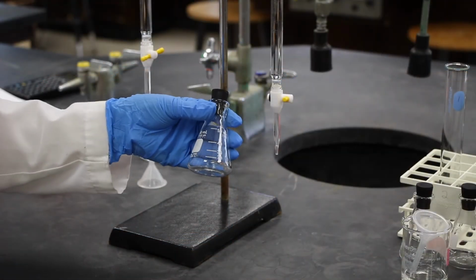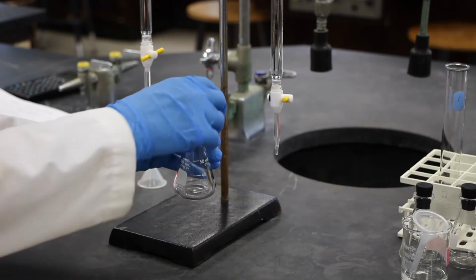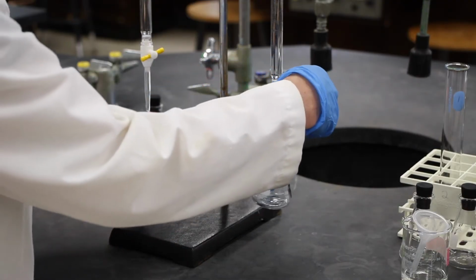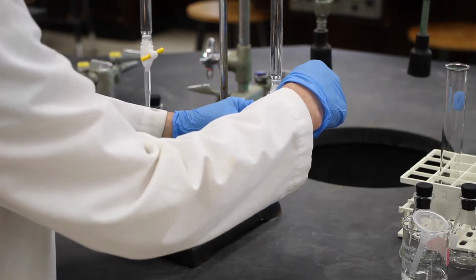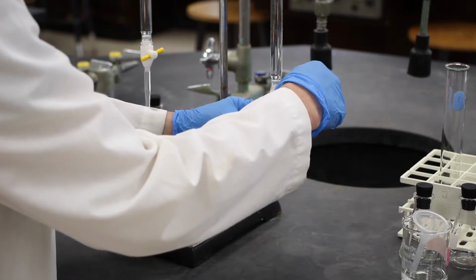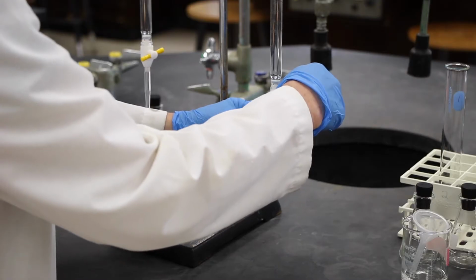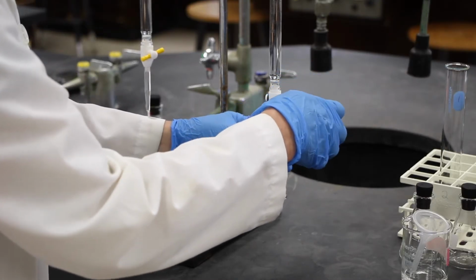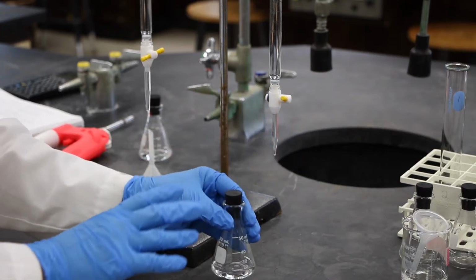Next, we'll deliver approximately 10 milliliters of the 2-propanol to this flask. I'd like you to read the burette.